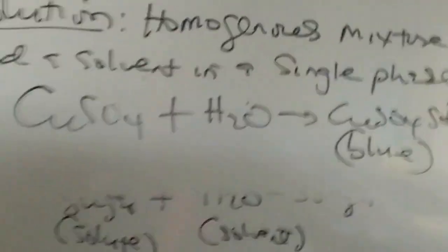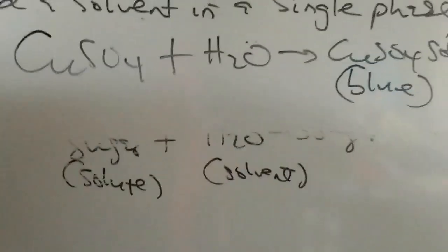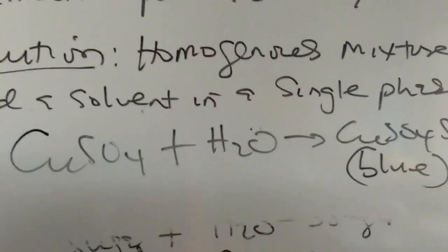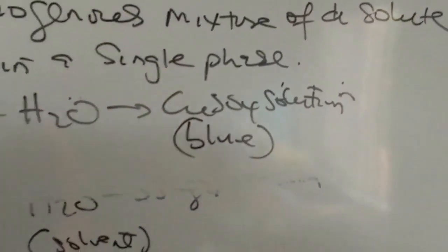But you know that here, even though it's drinkable, it is not transparent. It's not transparently clear, that is, it's not colorless. But it's an example of a solution, though you're not seeing the substance dissolved inside it. So our focus today will not be on solution, but on the other type of mixture called suspension.